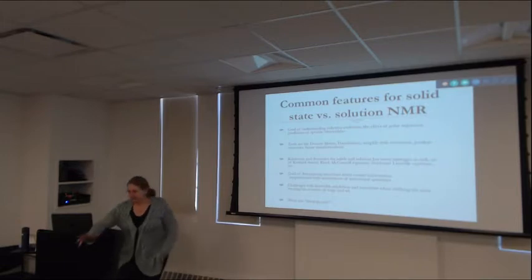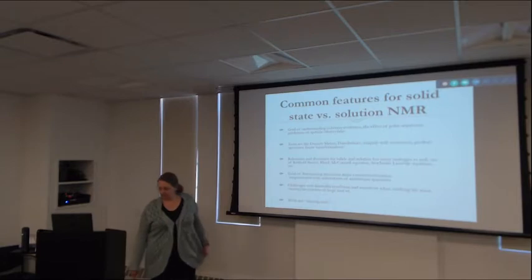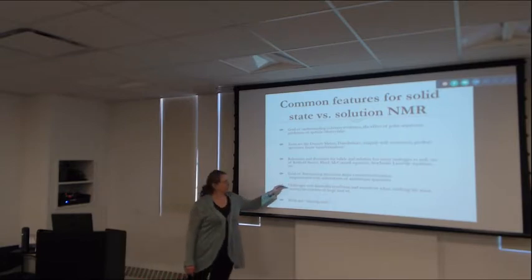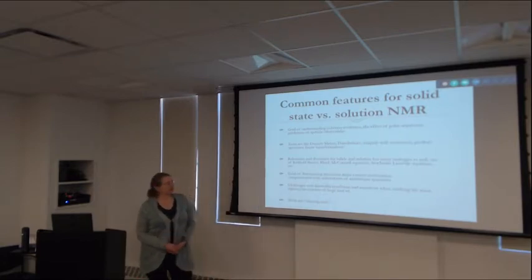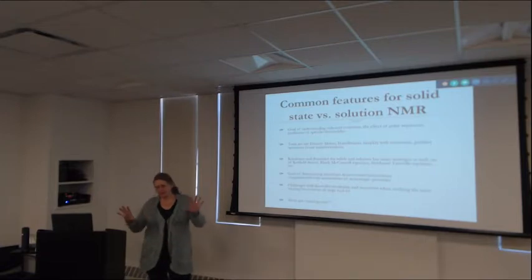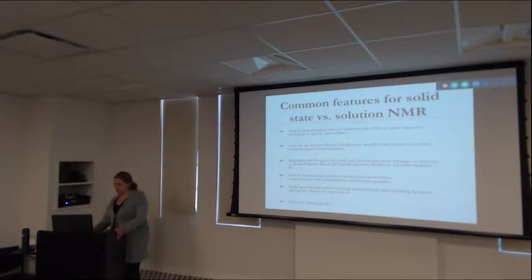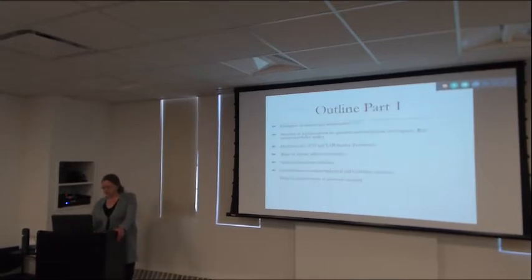And in a broader sense, in terms of practitioners in the field and what's exciting these days, what are we battling? Both communities are battling line width and sensitivity so that we can move on to the most exciting biological systems. And so there are so many parallels, and we're not starting over. We're adding a piece, and the piece is the orientation dependence of all the interactions.